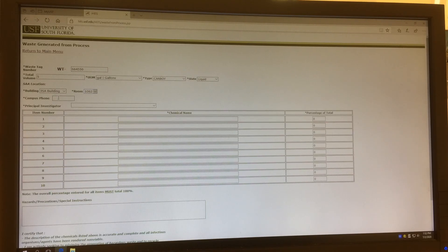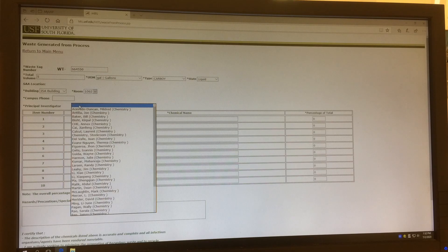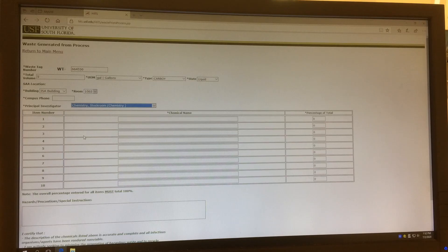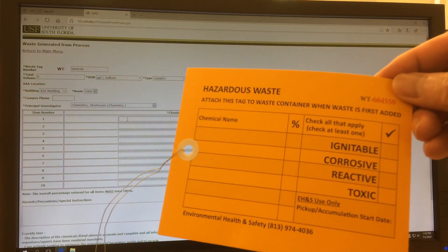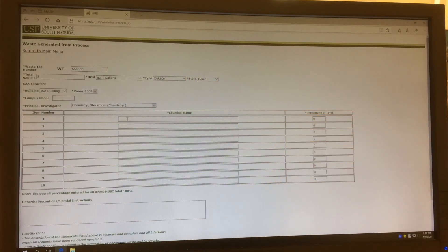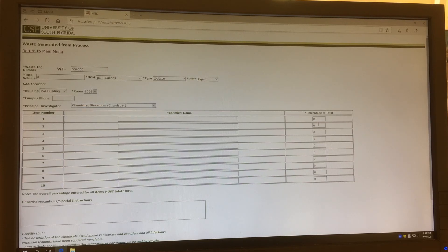The campus phone number — I would just put my cell phone number here just in case EHS has any questions about it later on. The Principal Investigator is Chemistry Stockroom. Then you copy all the information from the yellow tag to here, like the chemical name and the percentage. The total percentage should add up to 100%.